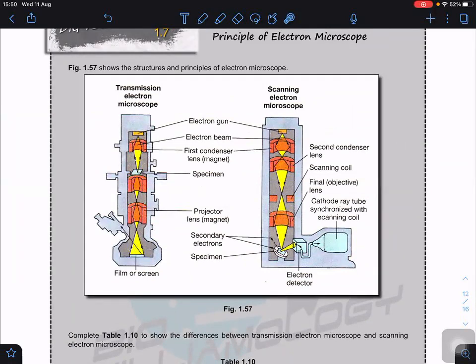Okay. Then what we can use it here is, if you compare both of them, these parts, the chamber here, when you want to operate, you need to operate it in a vacuum. So first thing, you need to suck out the air from the chamber, because if no electron bombards the air and the dust, then confirm you're going to generate the heat. Are you clear? Clear. So inside here, it must be a vacuum.